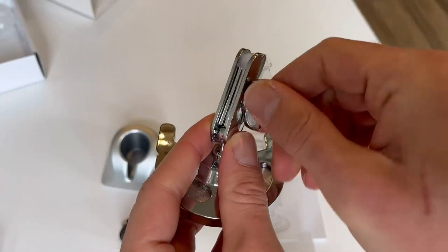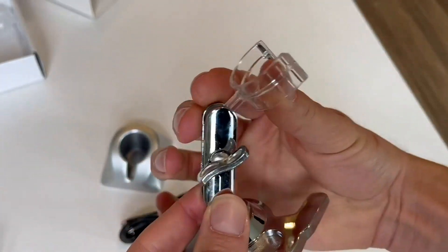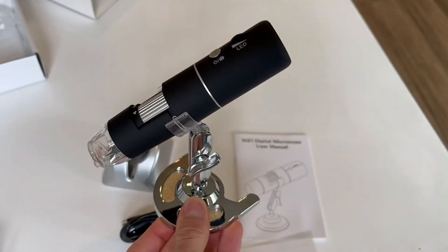This little stand is very cool, very adjustable and customizable to what you want to do if you want to have it be still. Depending on what you're looking at, you can hold it steadily and point it up, down, left, right — really position it exactly where you want to.